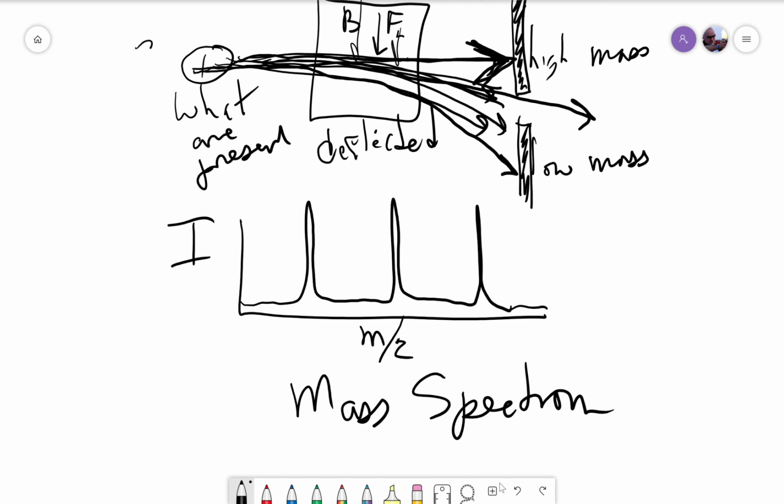If three different molecules existed, weighing 36, 44, and 58, then we would see three different peaks corresponding to the masses of those particular molecular weight molecules that existed in the sample.